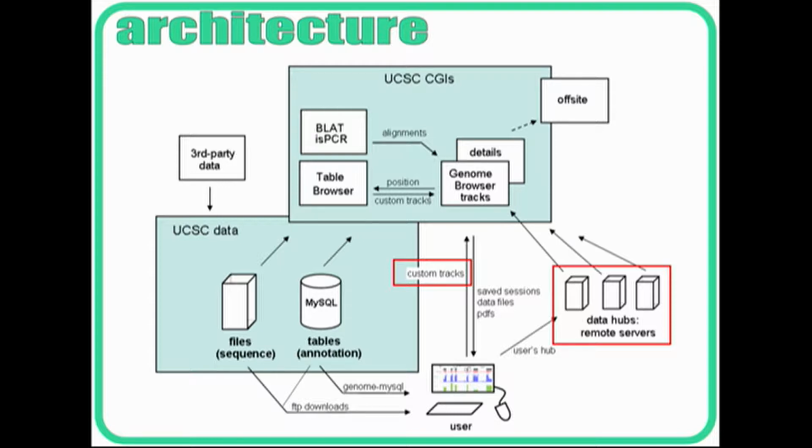And then you can go from gene to gene to gene and see all of the other information you might be interested in. Data that are really large or too complex belong in data hubs because they're too big to upload. BAM files and VCF files are both too big to upload as a static process because it takes forever to upload and it times out. And so in a case like that, the file needs to go on a server so that our server can talk to your server. And instead of loading the whole file, we pull out just the slice of the file that's relevant for the picture you're looking at. And so that makes it a very quick transaction.